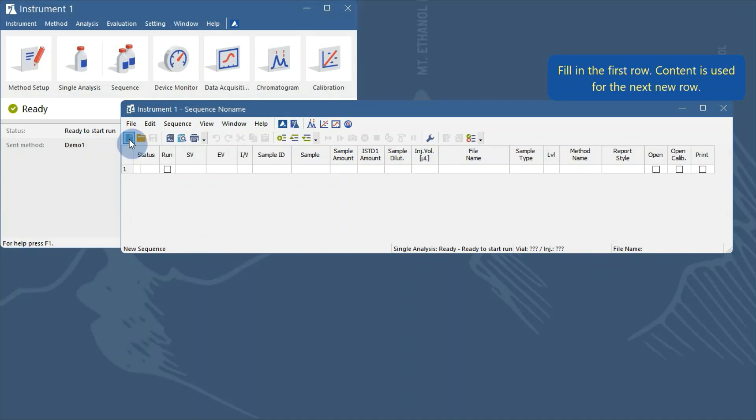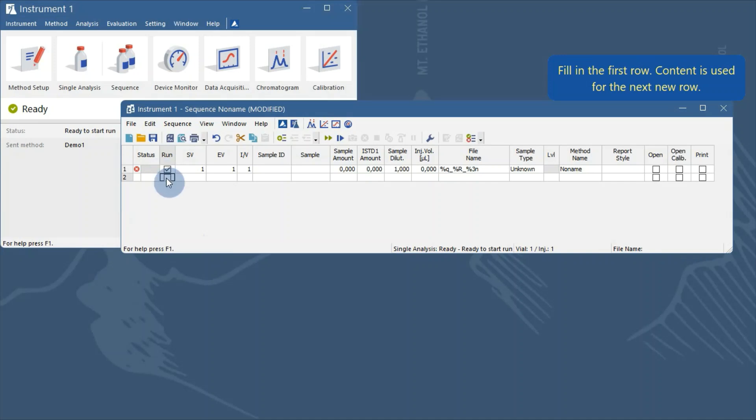The cell content is copied from the previous row when a new row is created. Check the run check box on the first row, and the default values will be filled in.